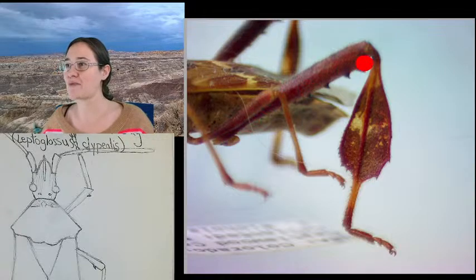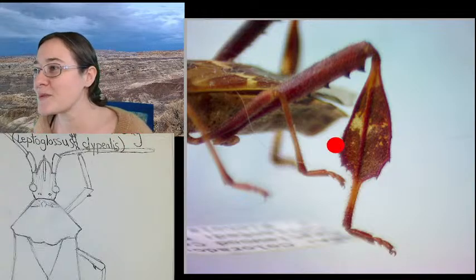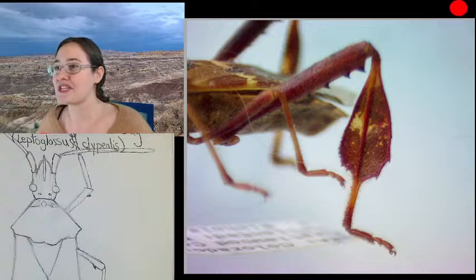Then we're coming up. We've got this femur. We have the tibia. And this is our really awesome expanded tibia for our leaf foot. He's got some fun little spines on the edges, too. Maybe we'll zoom in even further. And then coming down for the tarsi. So I'm going to go ahead and start getting this sketched.